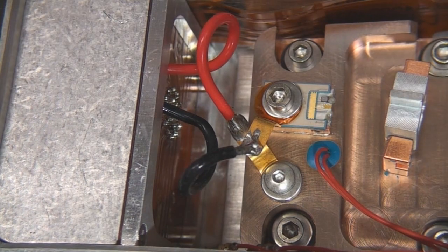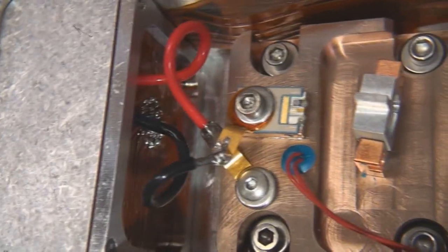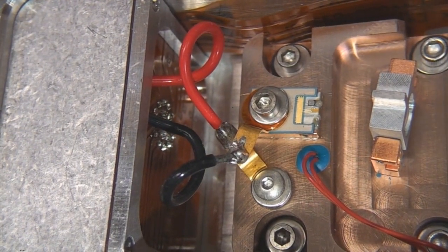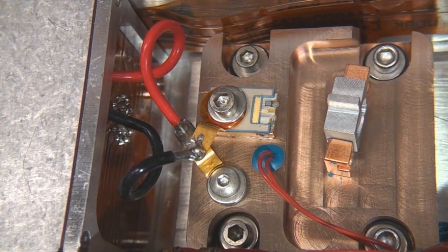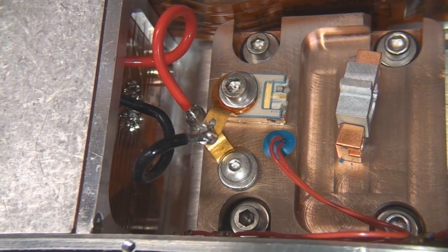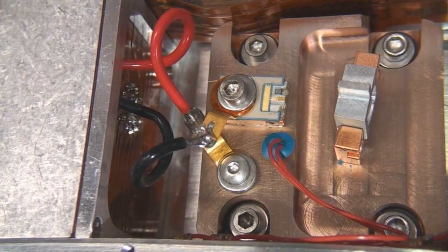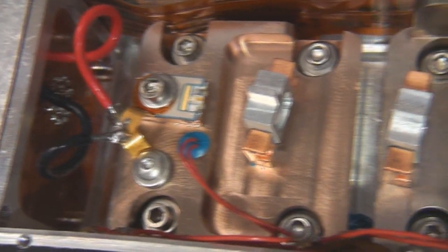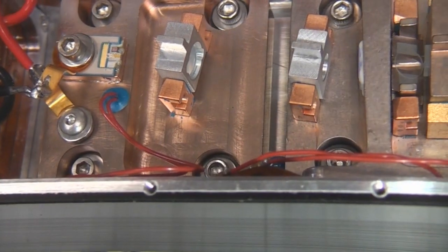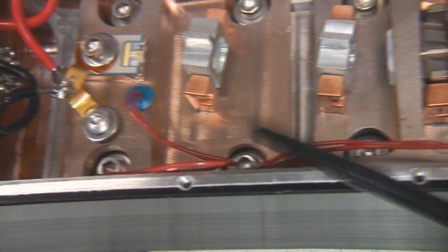Now, it should be possible to figure out which of these pins, but unfortunately the way this is all constructed, I suspect this back connector and this flex goes in first, and then the coolers and then the optical blocks go in second. Of course I don't want to take these optical blocks out because that's almost certainly going to screw up the alignment, although I can't actually see any locking resin on these, but I'd really rather not touch that, assuming this is a working unit.